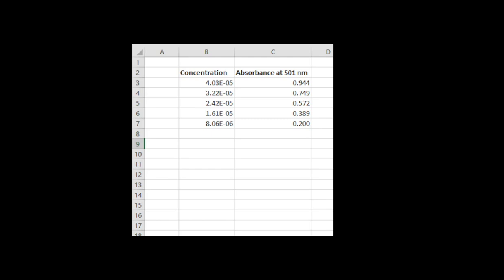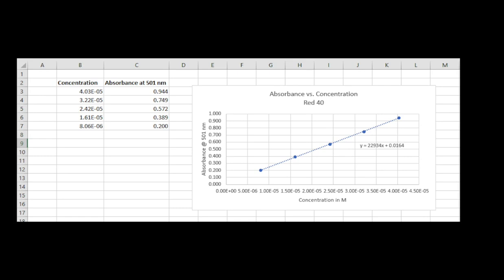Using the concentration and absorbance columns, you can create a graph of your data. By adding the trendline and its equation, you will have the information you need to use Beer's Law.